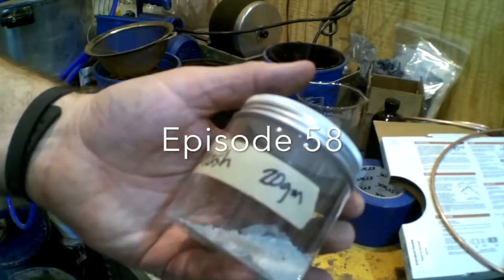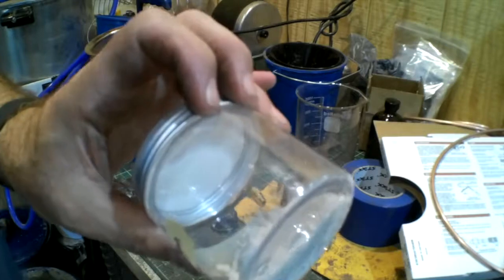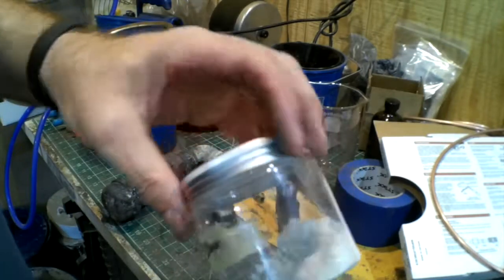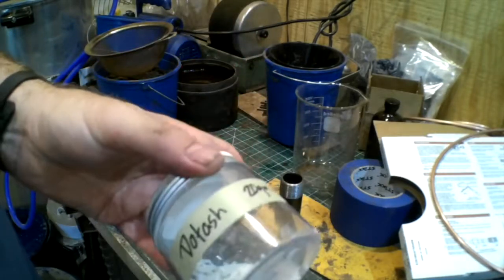So this is potash that I made. Now that I've made potash, what I want to try to do is turn it into potassium. After all, potassium gets its name from potash. I've managed to make the potash. What I really want to do is see if I can get potassium.